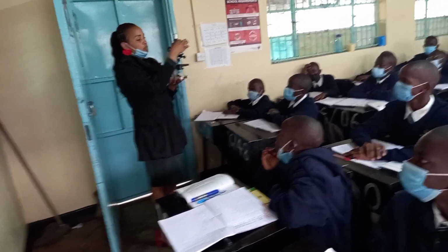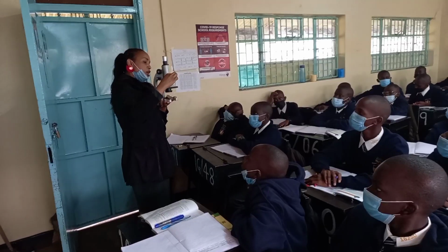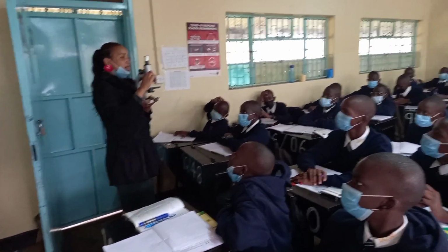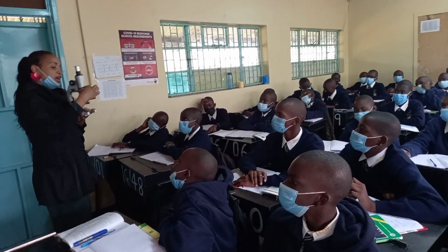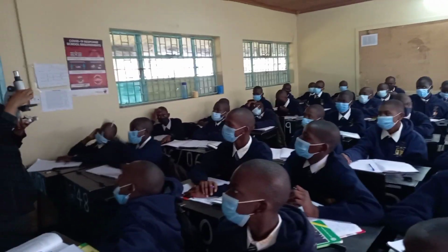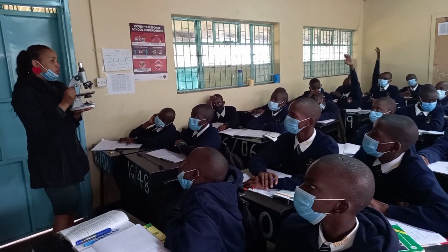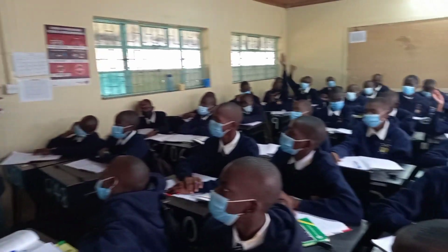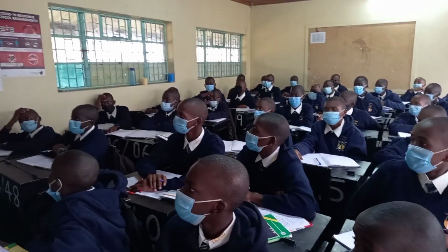What is the function of the body tube? Holds the eyepiece and the revolving nose piece. Correct. See the revolving nose piece? Why is it called revolving? What does it do? It revolves. You see? Yes. So what is the function of the revolving nose piece? This is it, and you see these below. What does it hold? It holds the objective. Apart from holding the objective lens, what else does it do? It is able to change from one objective lens to another.